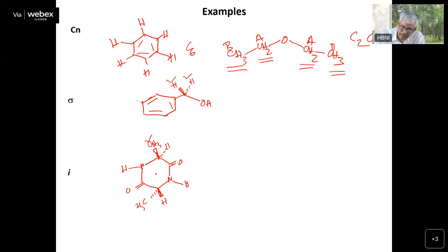This methyl and this methyl are connected by the same line and are equally away from the center. See, this hydrogen and this hydrogen also have the center of symmetry. This hydrogen and this hydrogen. So you will see that these two methyls also come at the same place. These two hydrogens also have the same chemical shift, and these two hydrogens also have the same chemical shift. So they have the center of symmetry.